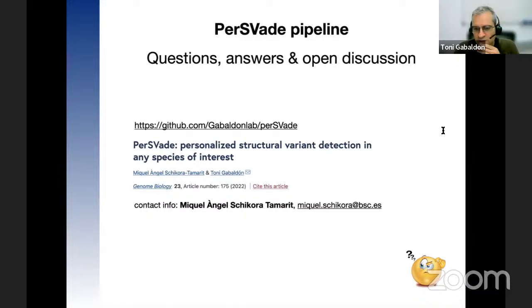You depend on the input data. All this is important for structural variants, but you can always use it for point mutations like SNPs. They will perform equally well with single reads. But there will be no point in detecting structural variants if the genome is very fragmented or if you don't have paired reads. Yeah, you'll be missing many.